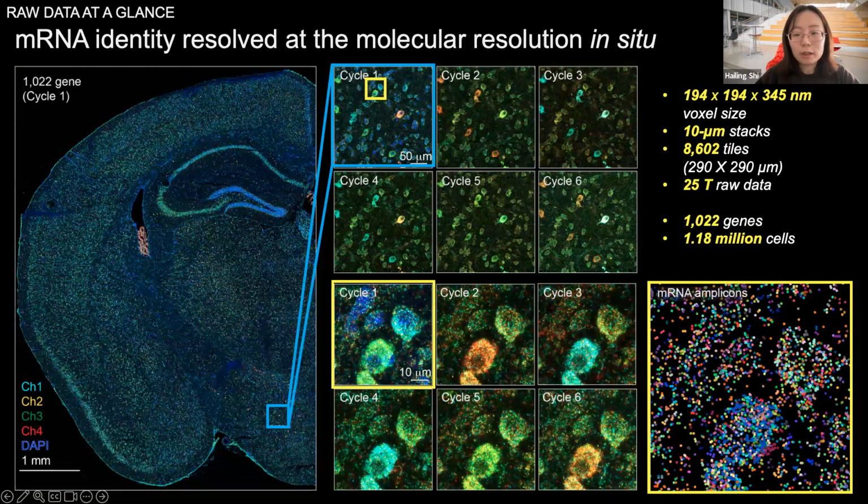For individual single cells, depending on cell type, we usually have around 100 to 200 different genes and about 500-ish reads, or RNA spots, in the cells. So it is definitely doable to have more genes to accommodate a specific experimental need.